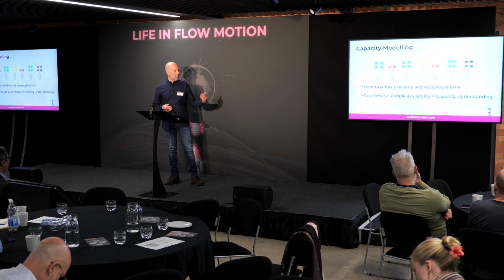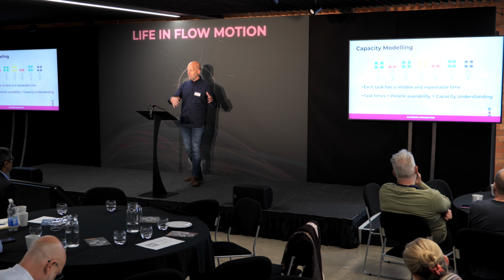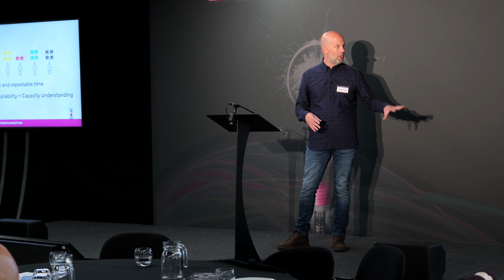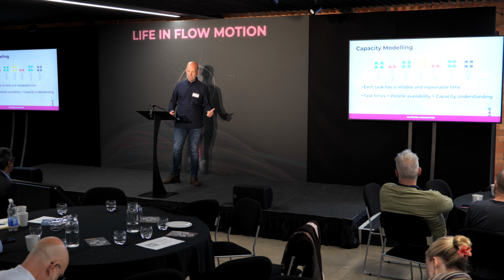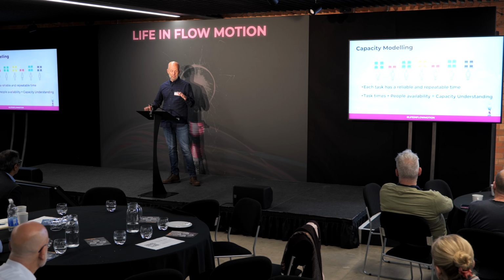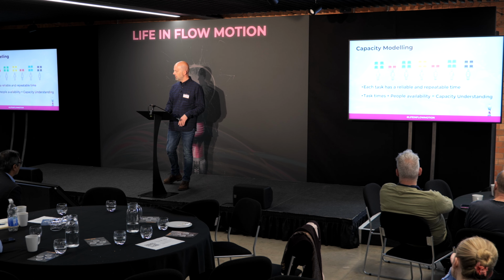But when you have got reliable and repeatable data for your constraint, which is your people, then you can start to feed that into a capacity model. So this is the holy grail of working in a lab. If you've got the times, you've got your people availability, then you can have your capacity. Your capacity is your people, you can just plug it in. And then you can start to effectively plan things like stability studies and validation, so you can level load across the year rather than having the huge peaks and troughs that can occur.